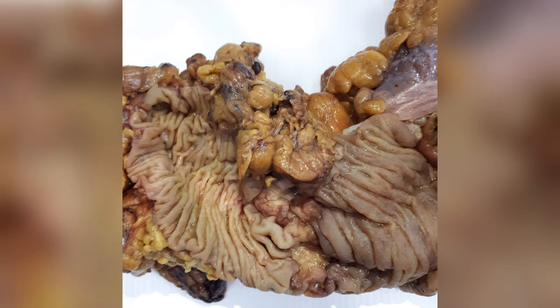Now, let us apply the art of describing to a real specimen. The picture shows an open colon. What can we say about the colon? We can say there are two lesions seen at the colon mucosa. We can further detail our description by saying or writing, the lesions are ulcerated, the ulcers have irregular margin, the edges are rolled up, the floor of the ulcers is made up of whitish material.